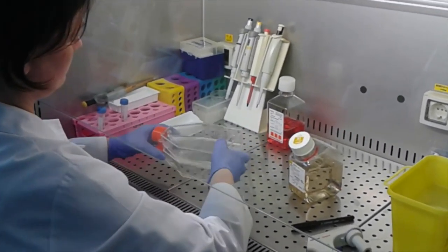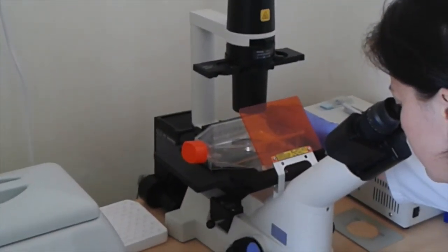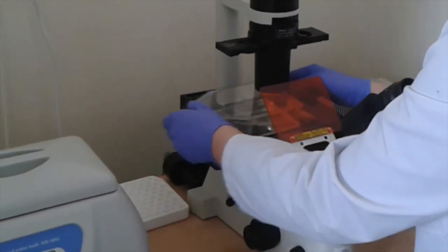Then the cells are visualized with the inverted microscope. Here we can see an orange plastic glass that is used for eye protection in the case of using fluorescence lamp.